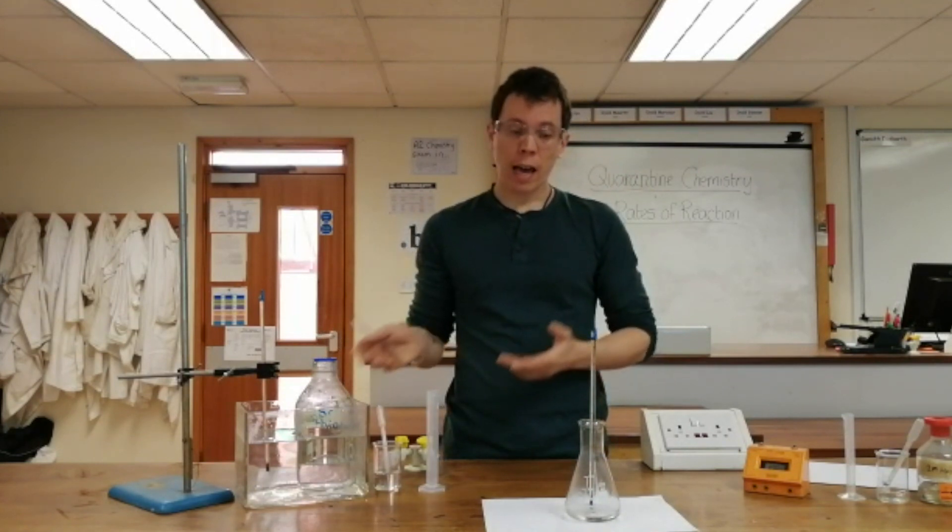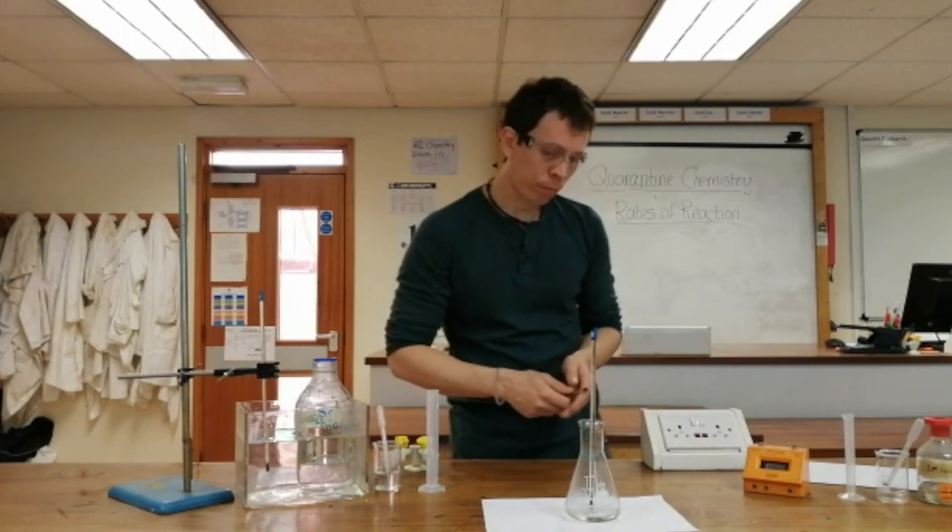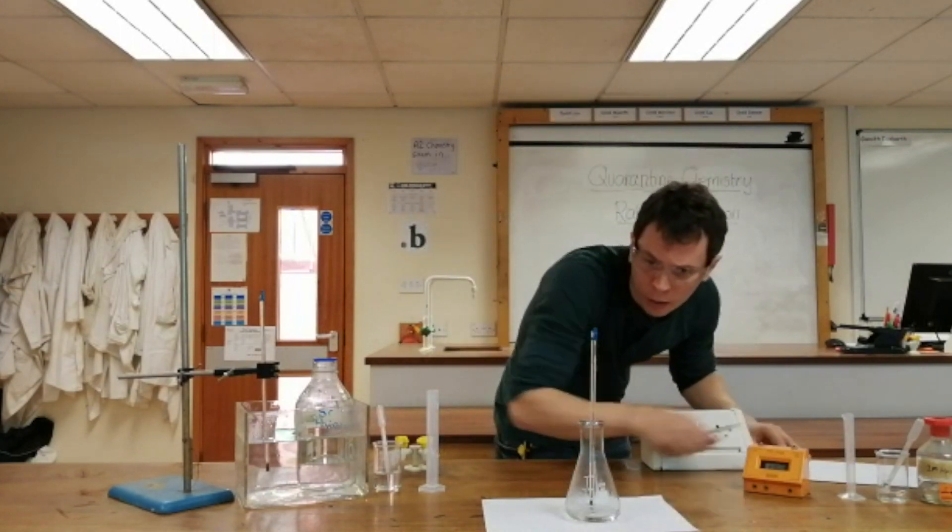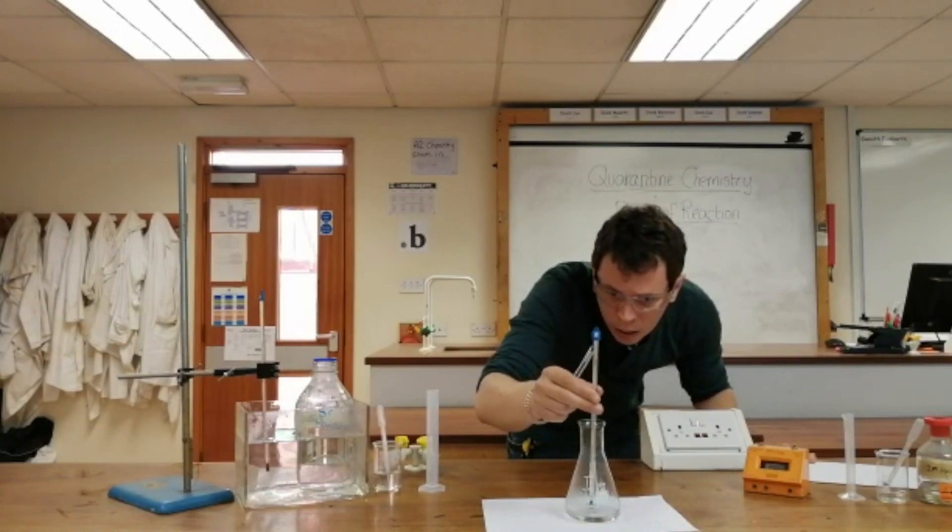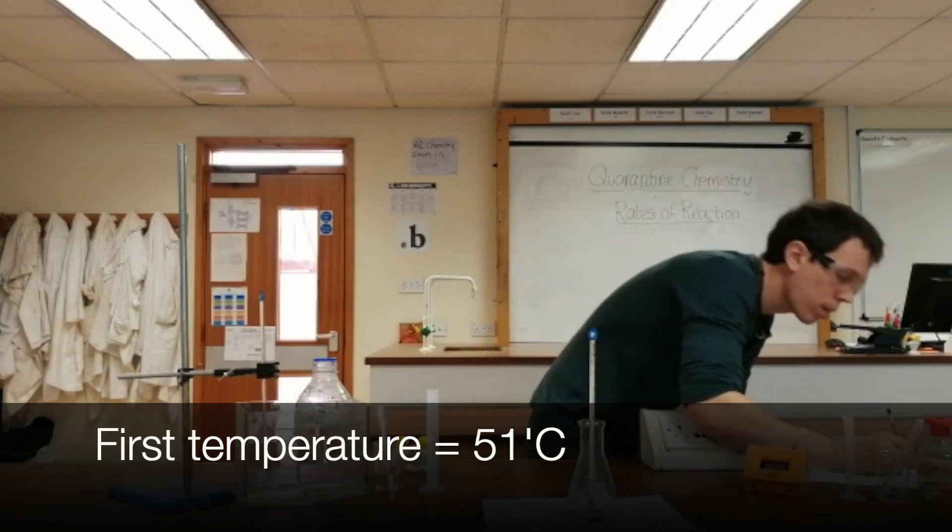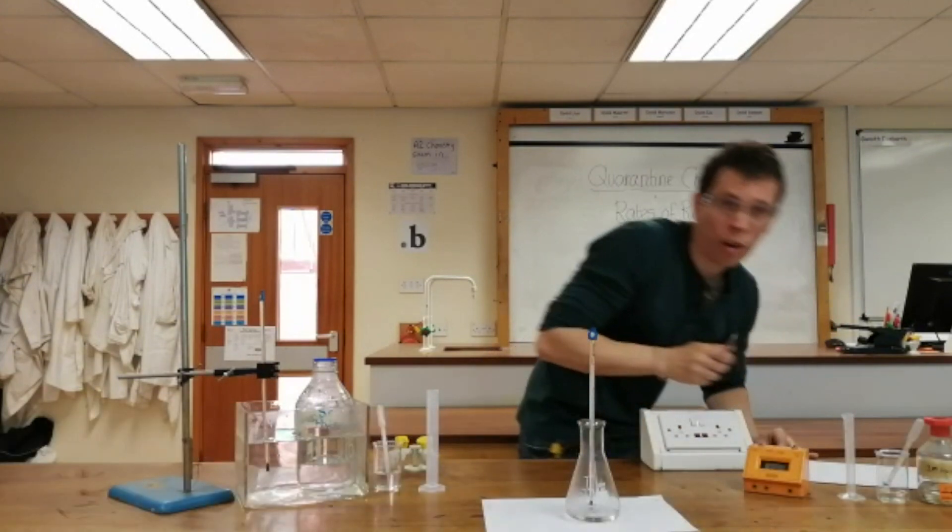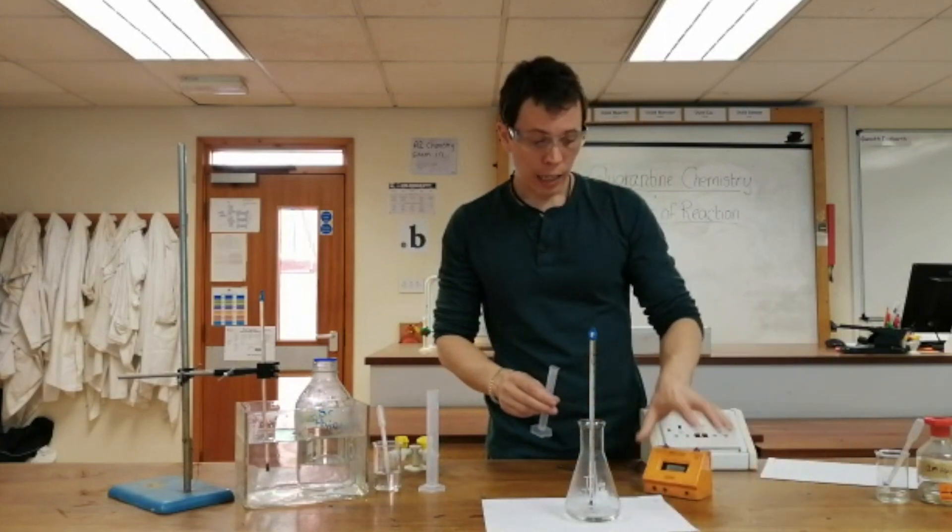My thermometer now is telling me that my mixture is at 51 degrees, so I write 51 degrees down in my results table. I get my stopcock ready.